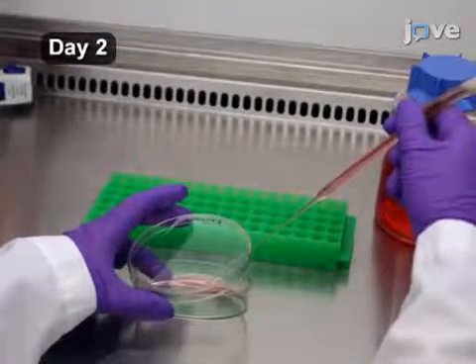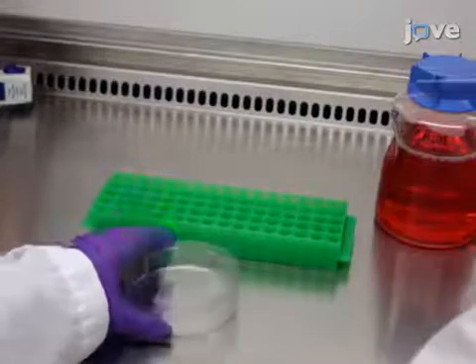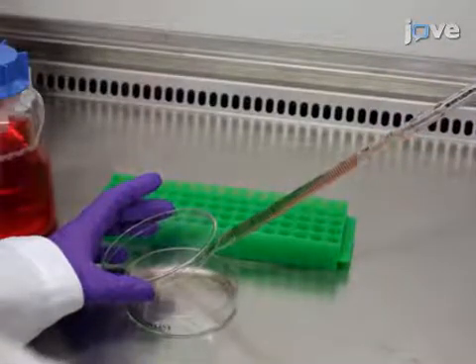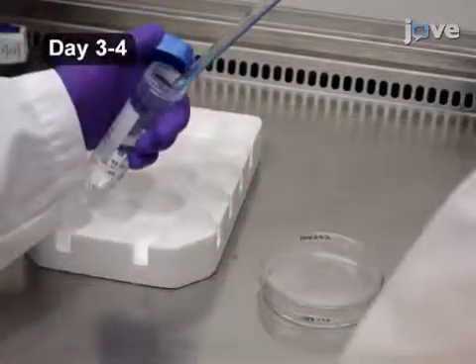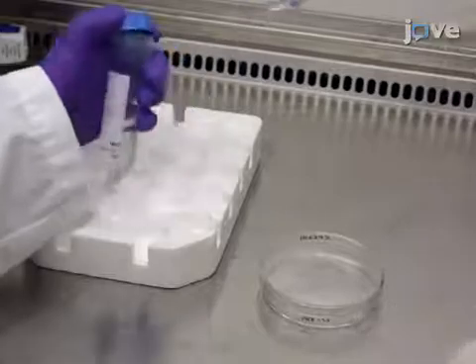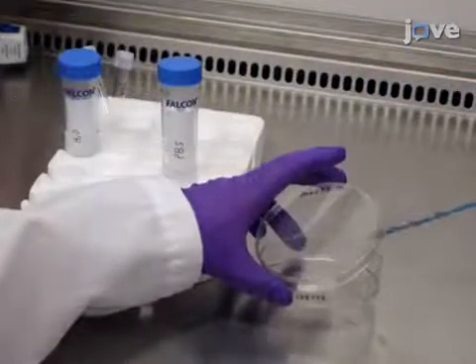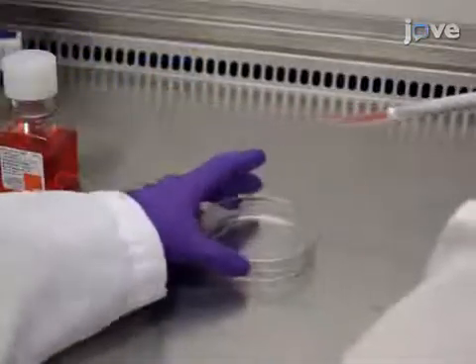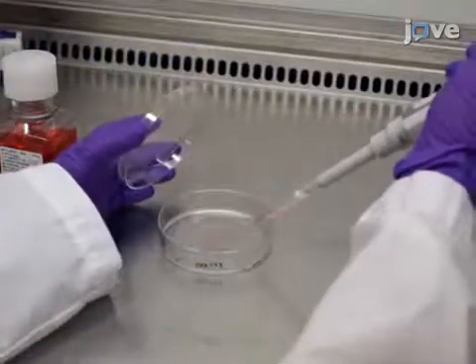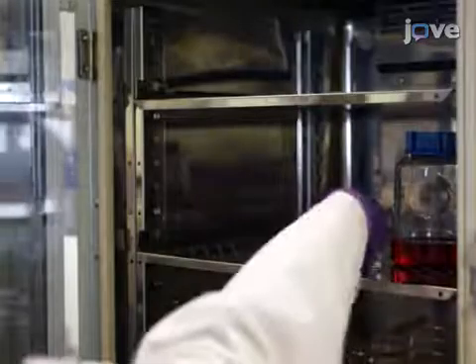24 hours after plating, change the media by aspirating the existing media and adding 10 milliliters of pre-warmed IMDM. Split the cells once they are confluent. To split the cells, aspirate the media and wash the plate with 5 milliliters of PBS. Then add 1 milliliter of 0.25% trypsin to the plate and incubate at 37 degrees Celsius until the cells lift off the plate.